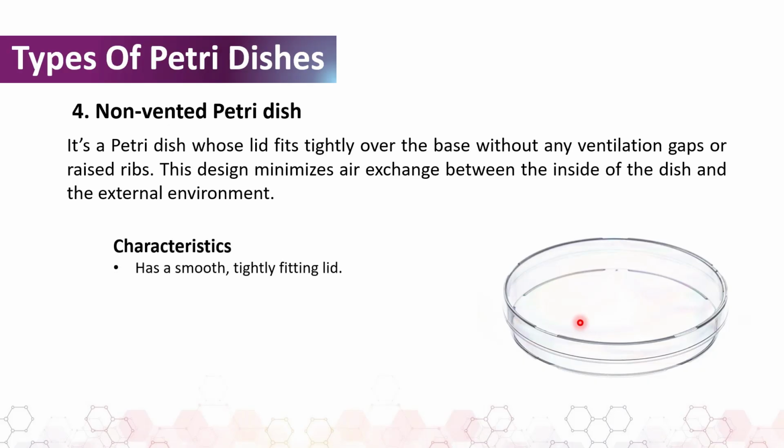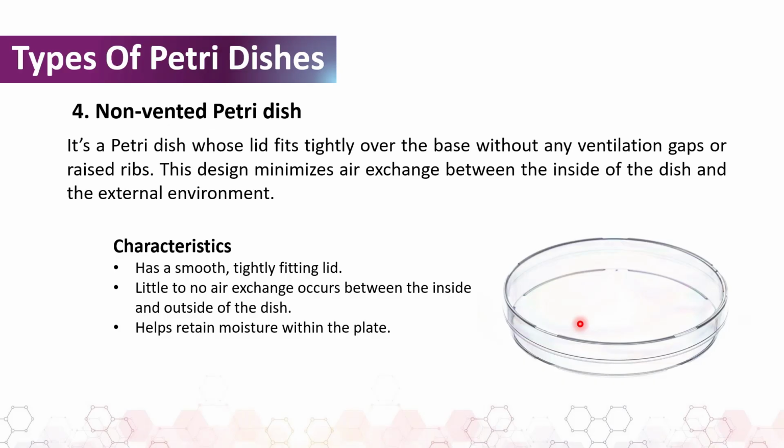So let's look at some of the characteristics of the non-vented Petri dish. 1, it has a smooth and tightly fitting lid. 2, little to no air exchange occurs between the inside and outside of the dish. 3, it helps to retain moisture within the plate. And 4, it provides greater protection against contamination during microbial work.